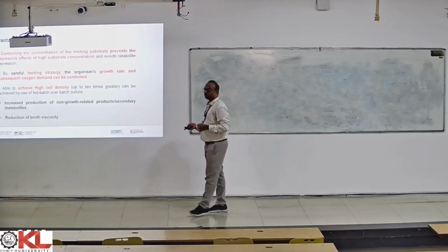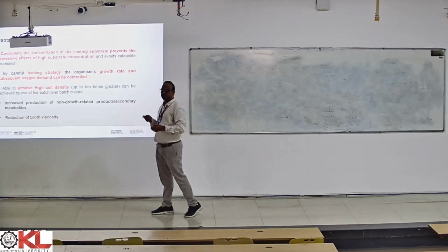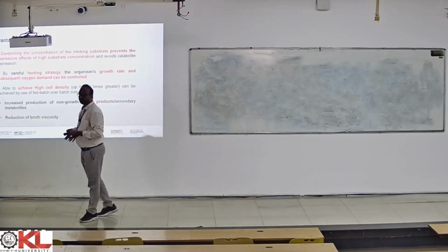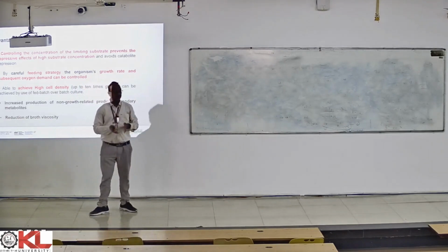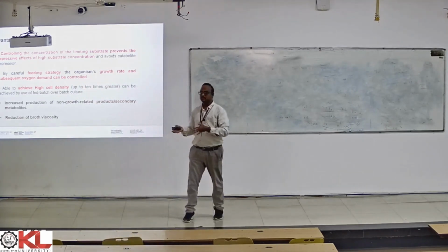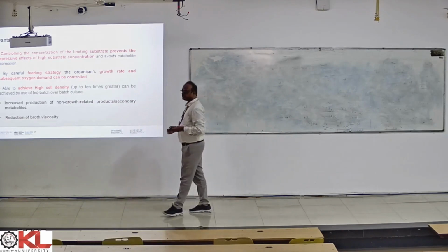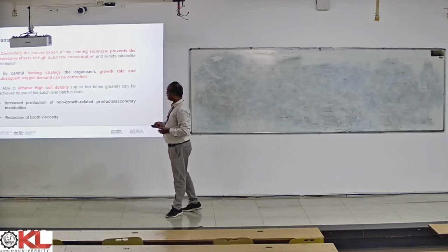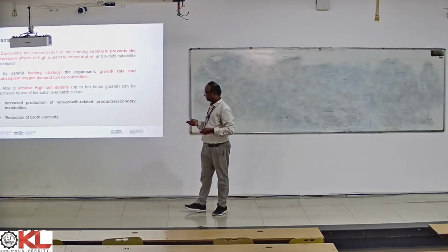And reduction of broth viscosity is also one major advantage. Why? Because by sending the feed in a very dilute form, we can reduce the viscosity of the media. With lower viscosity, the organisms can grow happily and produce the products inside the reactor.